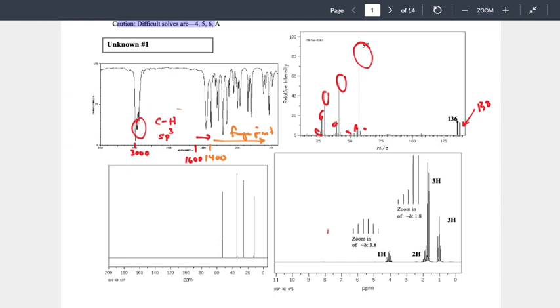Mass spec is about destruction, right? And the analogy that I typically use is a bit gruesome, and I apologize for that. But we could go back to old hardcore CSI stuff. If you ever watch shows where there was a bomb, and then the protagonist goes through and analyzes all the exploded patterns and says, oh, the person that made this bomb is so-and-so because there was a subtle detail of the components of the bomb piece that told us that it was made by this person. Okay? That isn't made up. They legit can do that.